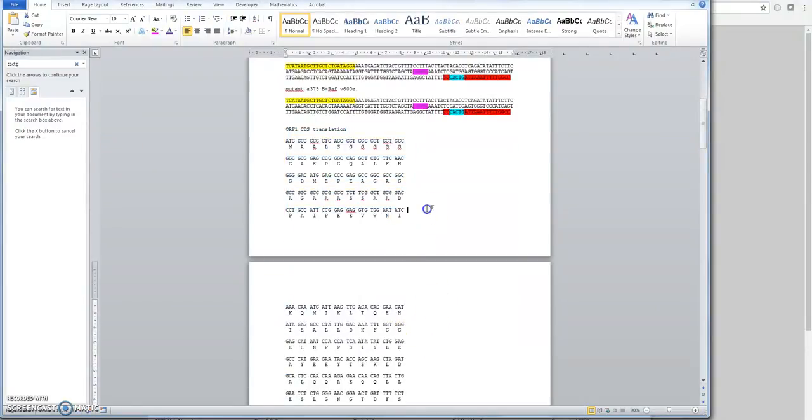Okay, so if this is right, we should be able to go down this sequence to get to amino acid 600. That should be roughly at base pair 1800. And each line of text here is 30 bases. So we want to be going down the appropriate number of bases until we get to position 1800.